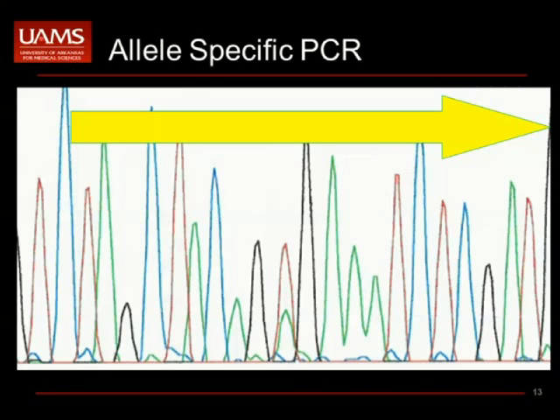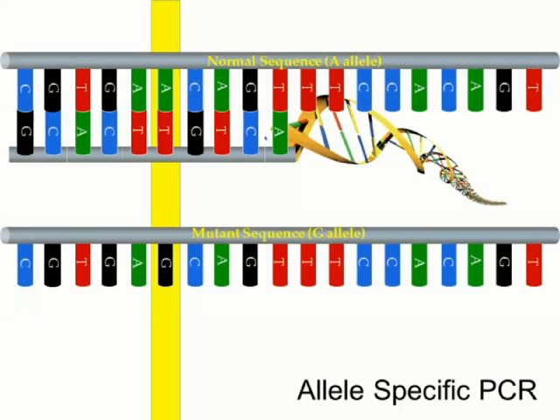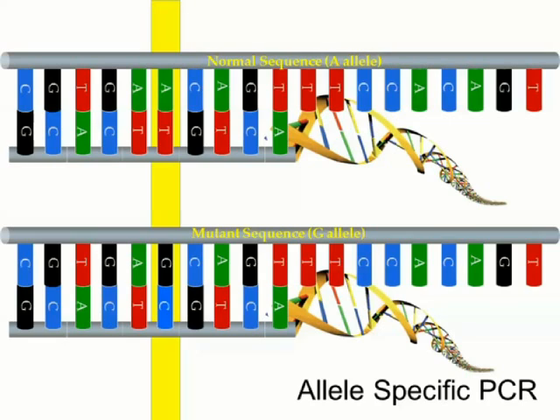It's actually GGT, GGC. It goes over just a little bit too far there. This is common. This is what we look at all the time for KRAS mutation analysis. And the way we can do that is highly variable, again, depending on the starting material and depending on what information and what output you need at the end.